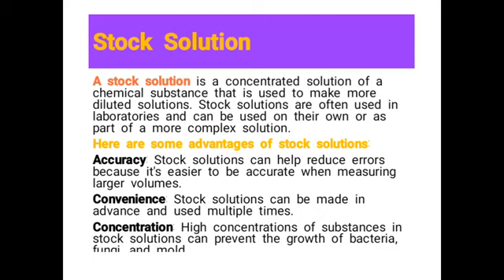However, if we need to dilute them and use them for other laboratory work, we can decide to dilute and then use them as well. So the way they come directly from the company, they are known as a concentrated or stock solution.